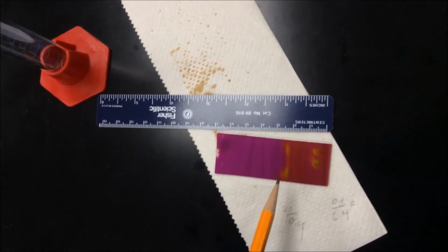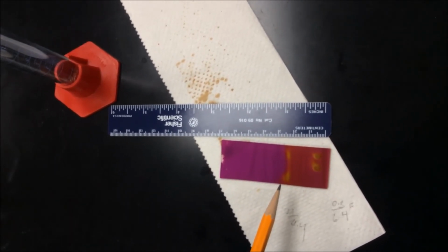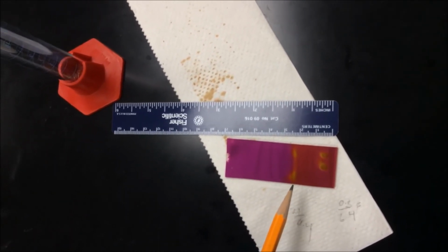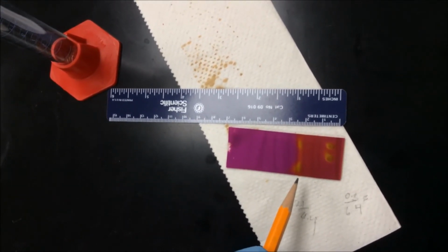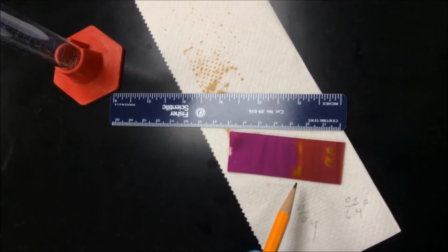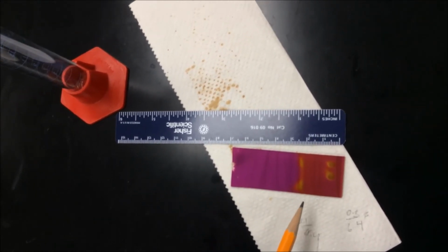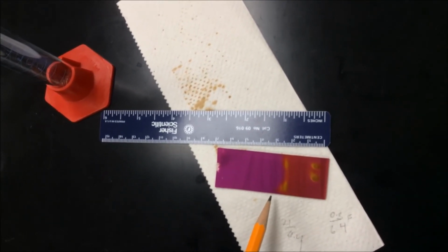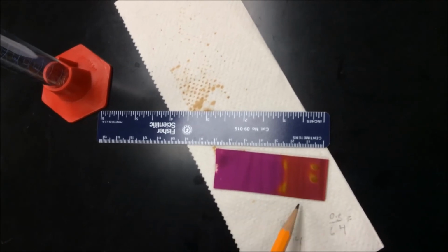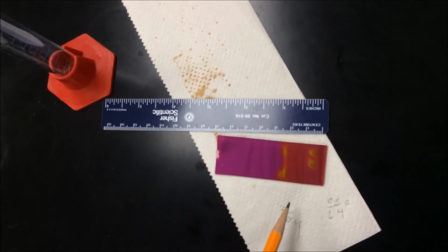Now you might wonder what is a good solvent or a good eluent. Just as a reference point for you, a good solvent would be considered one which has an RF ranging between 0.25 to 0.35, because at the end of the day you want to be able to run that on a column, so the results that you get on a TLC are essentially extendable to column chromatography.